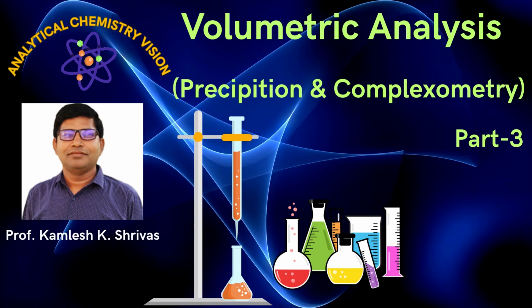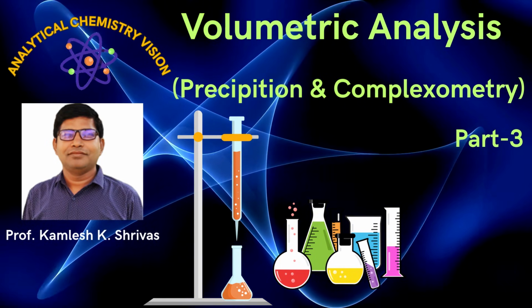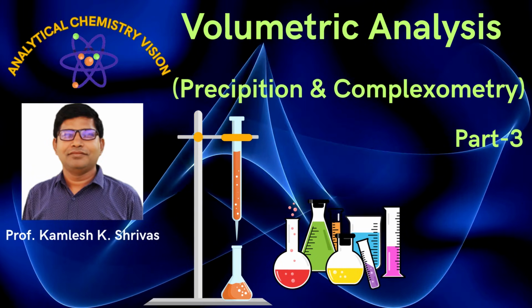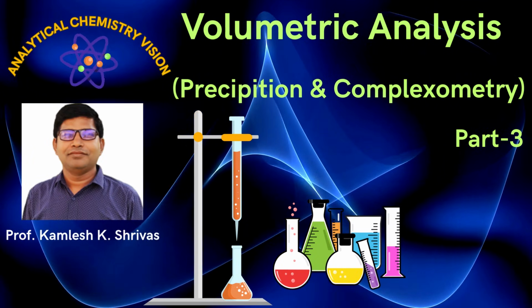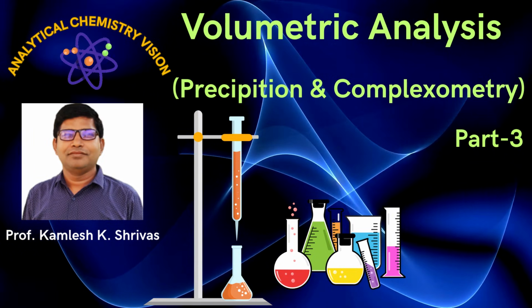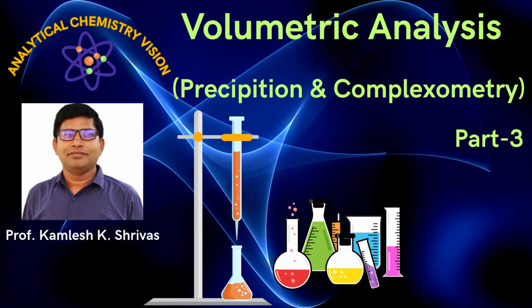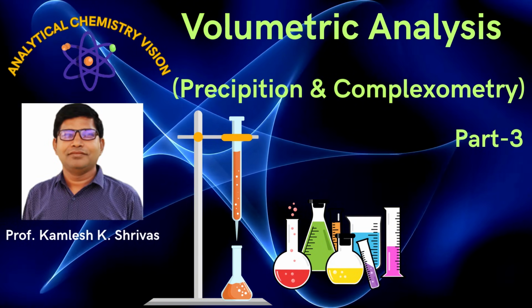Let's begin an interesting and highly useful topic for UG, PG, and research students: precipitation and complexometric titration. These techniques play a vital role in determining water hardness and chloride content in drinking and environmental water samples, ensuring quality, safety, and accurate chemical analysis.